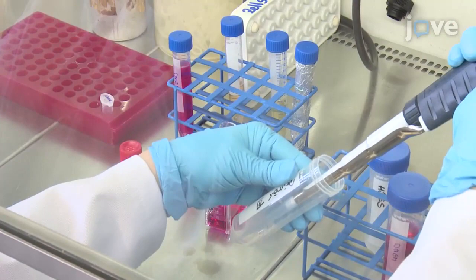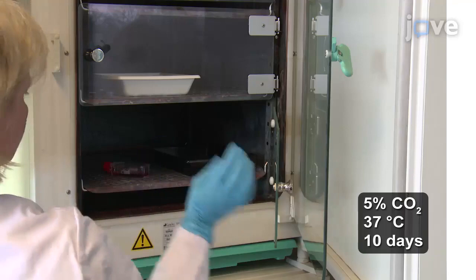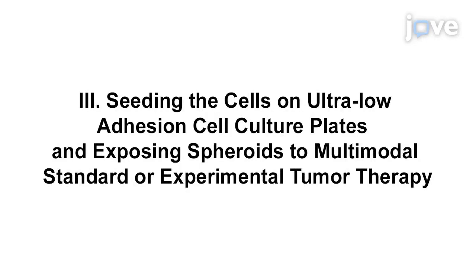After successful separation and subsequent washing, transfer the suspension containing 1 to 2 million cells into a T75 cell culture flask to grow to sub-confluency at 37 degrees Celsius for up to 10 days.